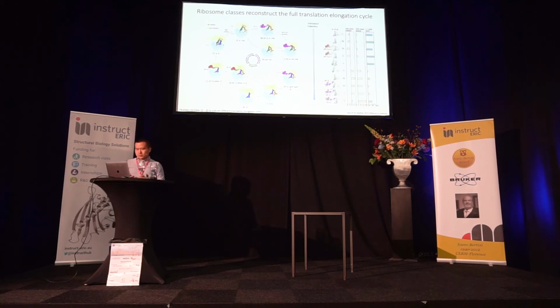Okay, also along this trajectory, we are able to again determine the continuous movement of elongation factors and tRNAs, and also we are able to quantify the rotations of the small subunit body domain and also swiveling of the head domain, and also the opening of the mobile L1 stalk of ribosomes.